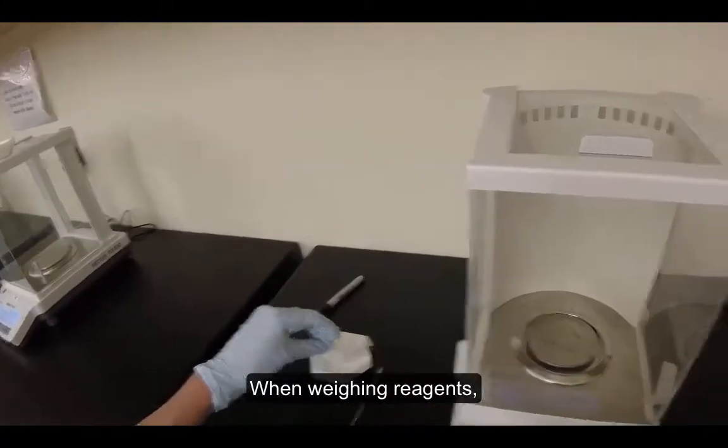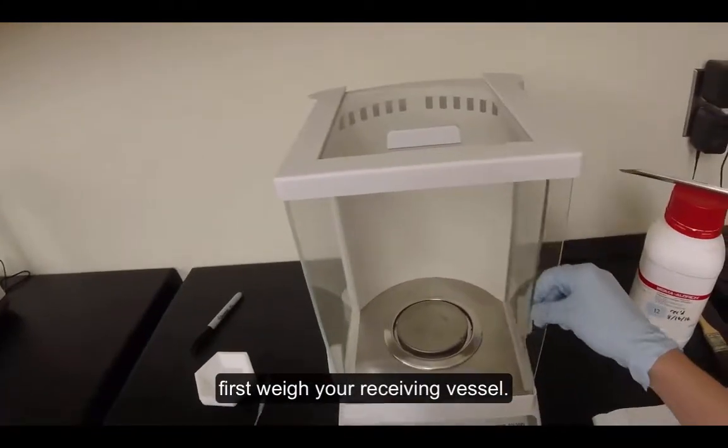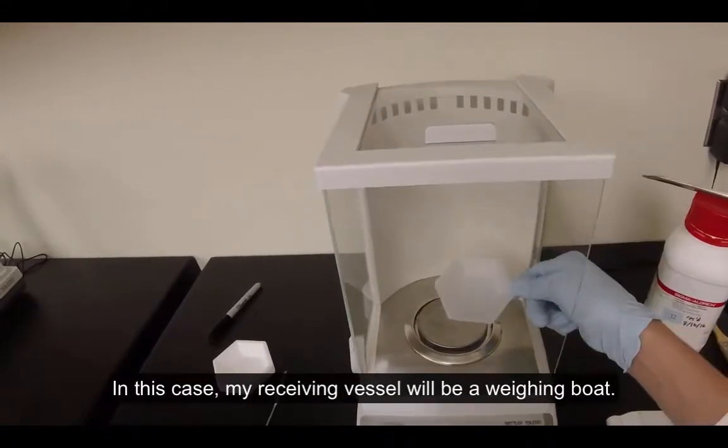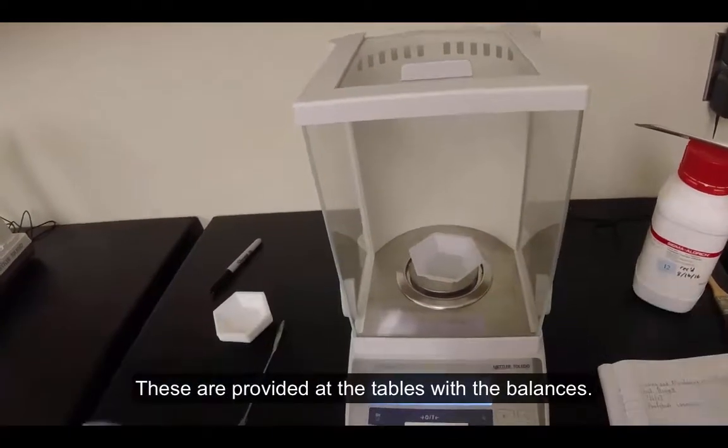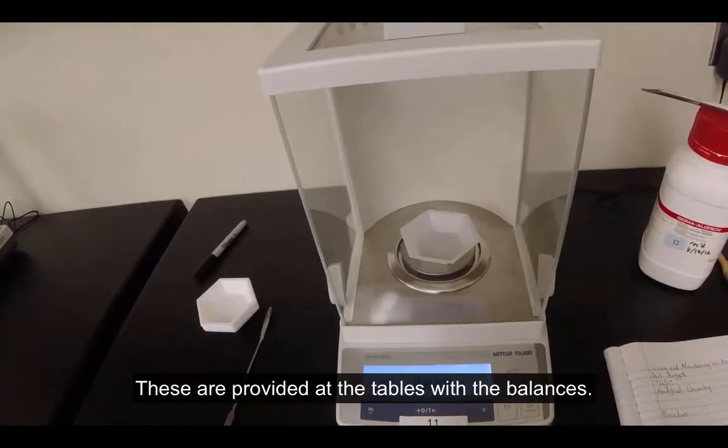When weighing reagents, first weigh your receiving vessel. In this case, my receiving vessel will be a weighing boat. These are provided at the tables with the balances.